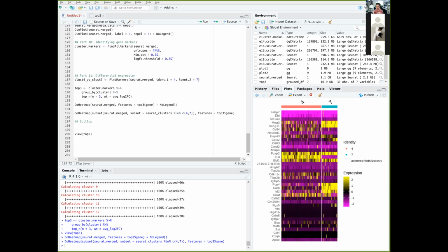You have to provide your own matrix with information on cell markers as input as well. So that will take some time to figure out your markers. And then you also have, this is another one for identifying gene programs, cNMF. This is non-negative matrix factorization, another way of identifying gene programs.